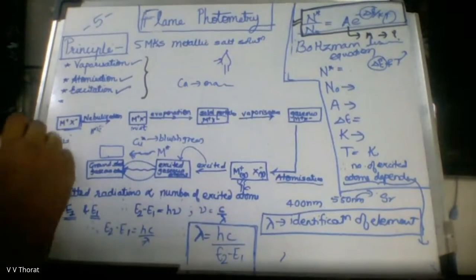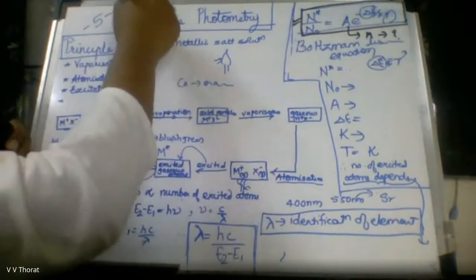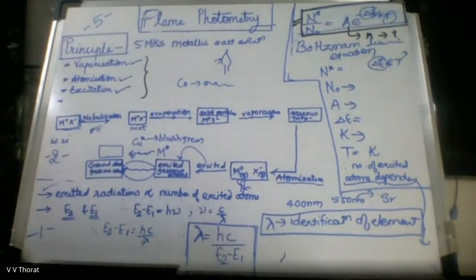And till now, if you have identified this is an elemental analysis technique. Now tell me, any difficulty till now, you can put in the chat box. Otherwise, we will go ahead with the burner part. Any difficulty? Who is it? Saurabh? Any difficulty?